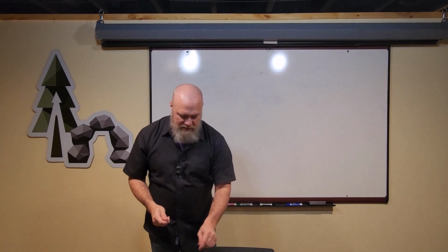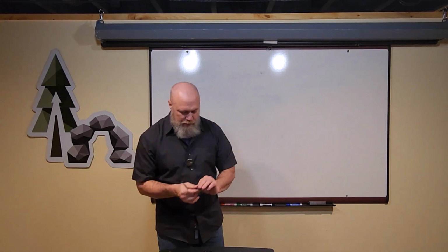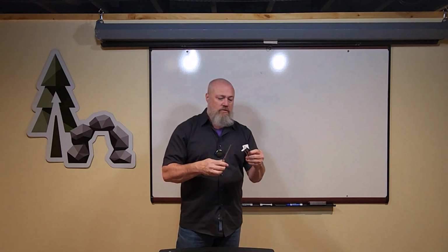Everybody wants to get in there with the scalpel and cut you. Don't be so quick with the scalpel. Your hemostats are also going to come in handy when you put your scalpel blades on the handles. So you're going to go over it. You will open up, right? You'll open up the scalpel package.